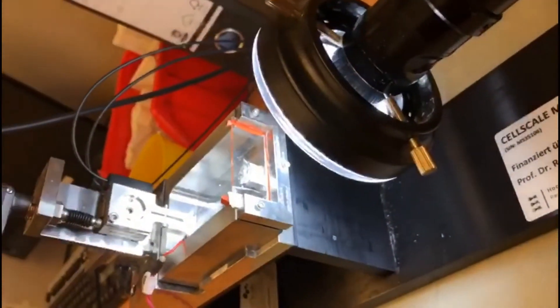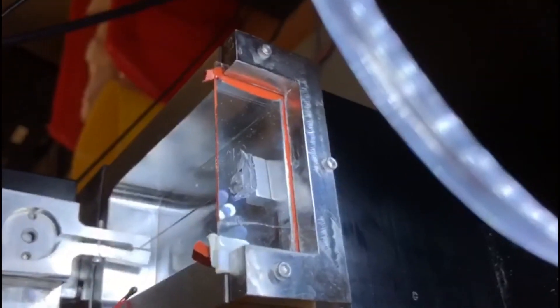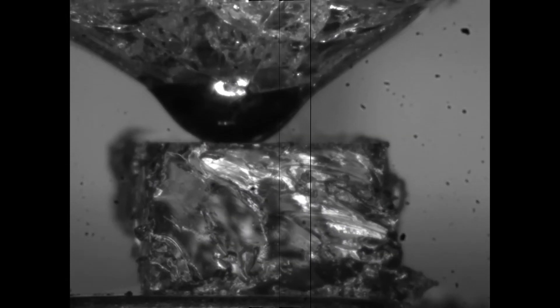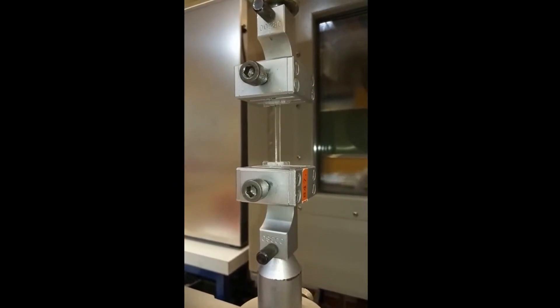Using the micro squisher from CellScale Biomaterials Testing, we were able to prove the elasticities of the two softer gels. For the stiffer one, we ran a tensile test and directly measured the elastic modulus.